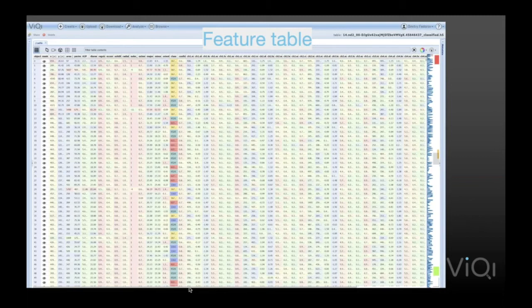And of course, the cell has a representation that we saw in the previous images in the different fluorescence channels. So there's descriptors of the bright field channel, and separately descriptors in all the other channels that you have for the same cell. And they could be the same descriptor, they just apply to the other channels. So what you end up with is this feature table. I think this one is 60 columns wide or so. We're looking at just a piece of it.